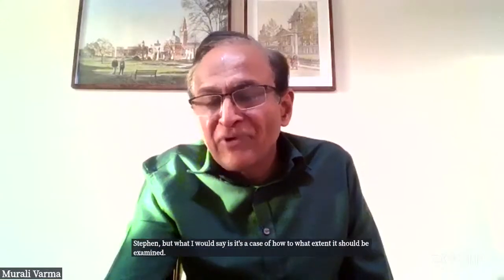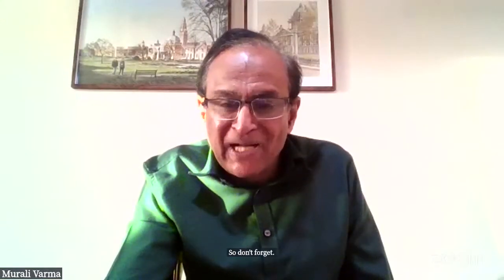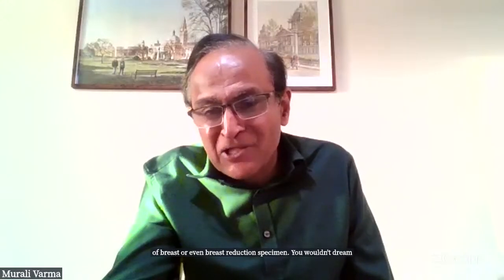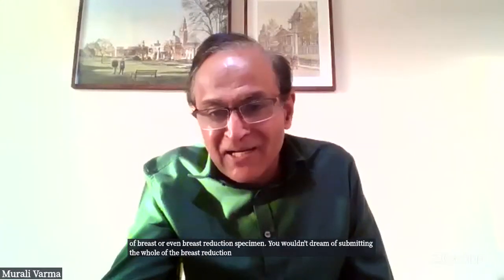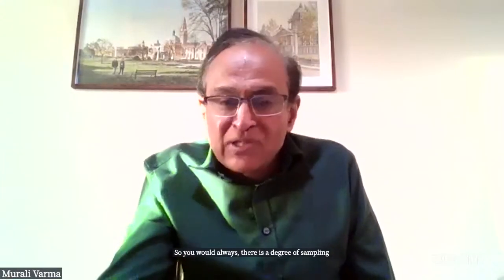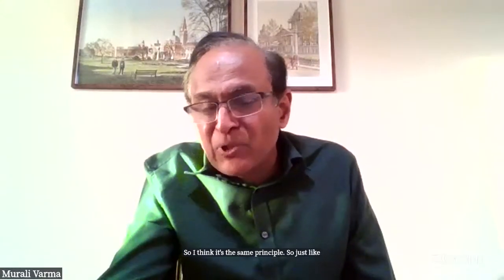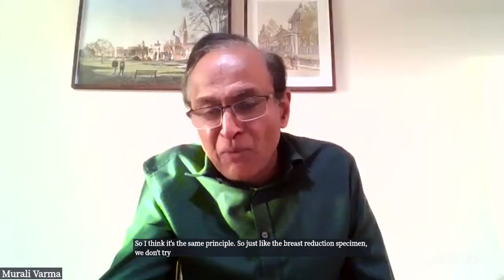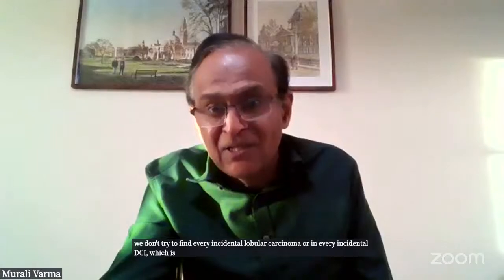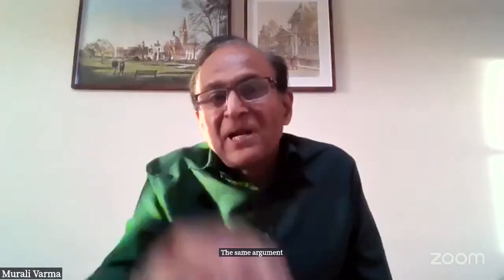Stephen, what I would say is it's a case of to what extent it should be examined. So don't forget, like a wide local excision of breast, or even a breast reduction specimen. You wouldn't dream of submitting the whole of the breast reduction specimen because there might be incidental DCIS, right? So there is a degree of sampling. So I think it's the same principle. Just like the breast reduction specimen, we don't try to find every incidental lobular carcinoma or every incidental DCIS, which is clinically significant. The same argument would, to me, apply for the TURP.